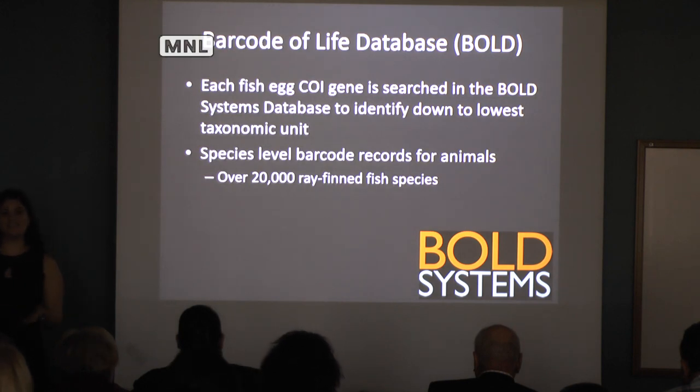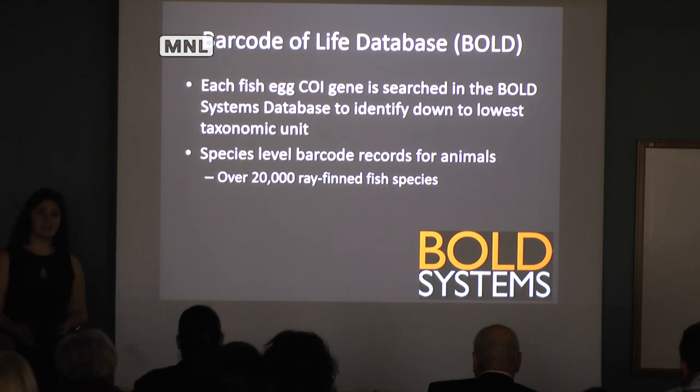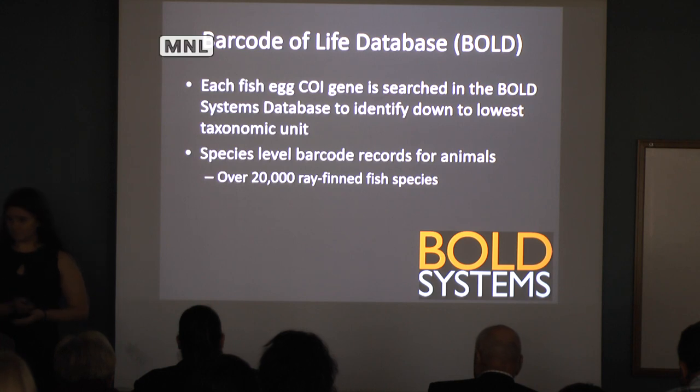Once I get back the sequences from the company, I put them in the Barcode of Life database. I get back a bunch of letters for each separate egg, and I paste them into the BOLD database. And it gives me back a species name to identify it. This database has over 20,000 different ray fin fish species. So that's a lot of things to match to, and that's what we are looking at.